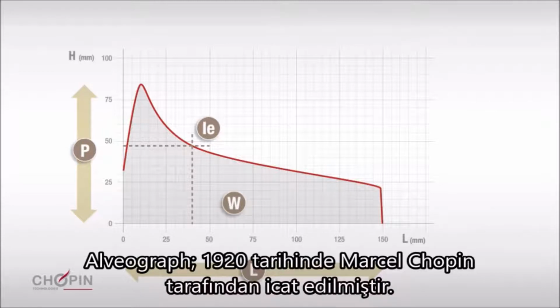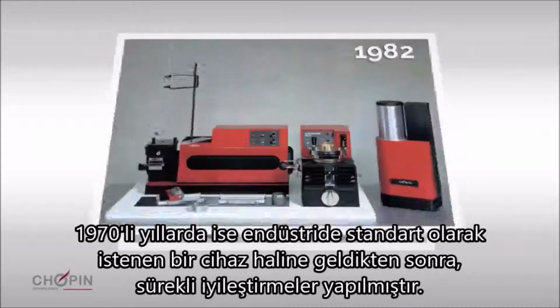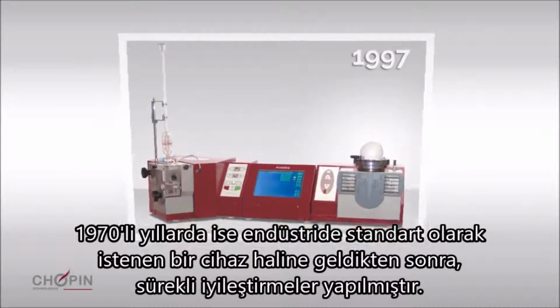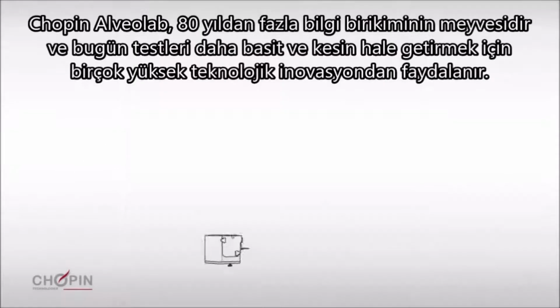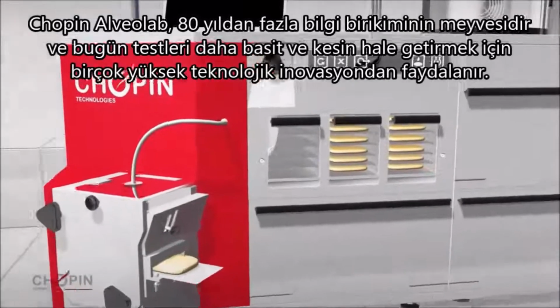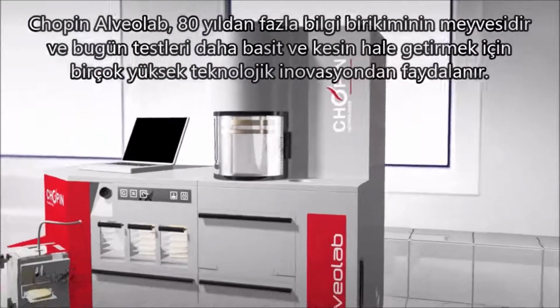The alveograph, invented in 1920 by Marcel Chopin, became an industry standard tool during the 1970s and has been subject to constant development and evolution. The Chopin AlveoLab represents the fruit of over 80 years of experience and today benefits from a number of highly significant innovations that make tests easier to carry out and more precise.